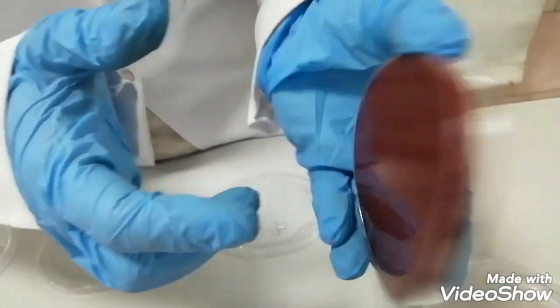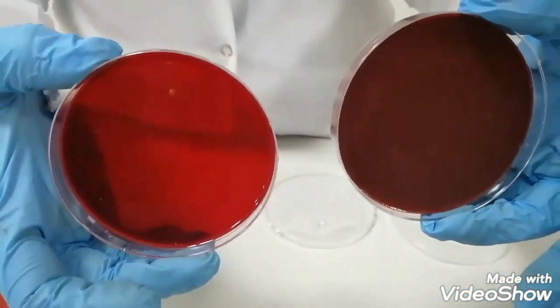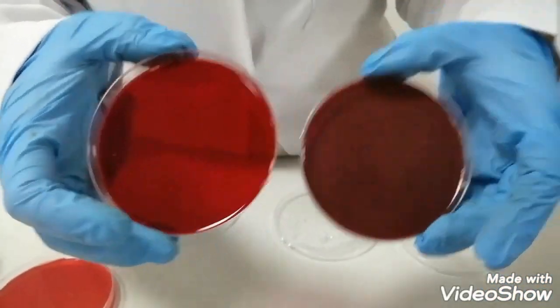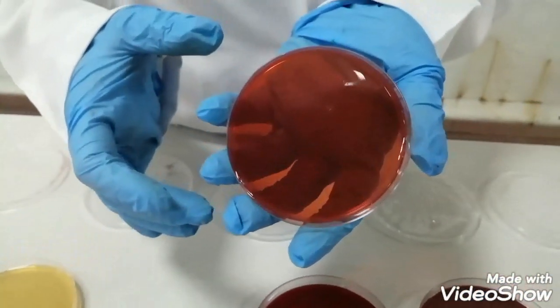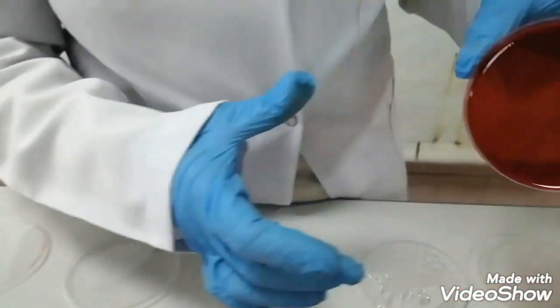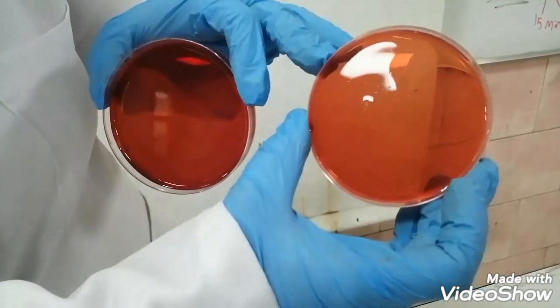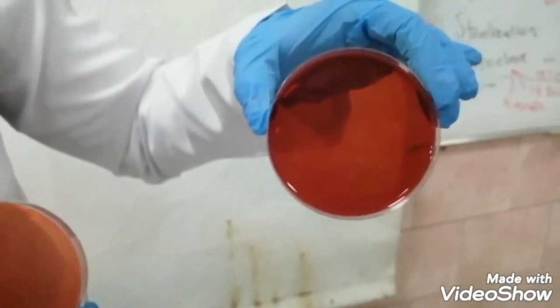This is the chocolate agar, which has a brown color, while the blood agar is red in color. The chocolate is heated blood, while this is the blood only, without heating. These are examples of solid culture media. This is mannitol salt agar, and this is MacConkey agar. The orange one is the mannitol salt agar, and the pink one is the MacConkey agar.